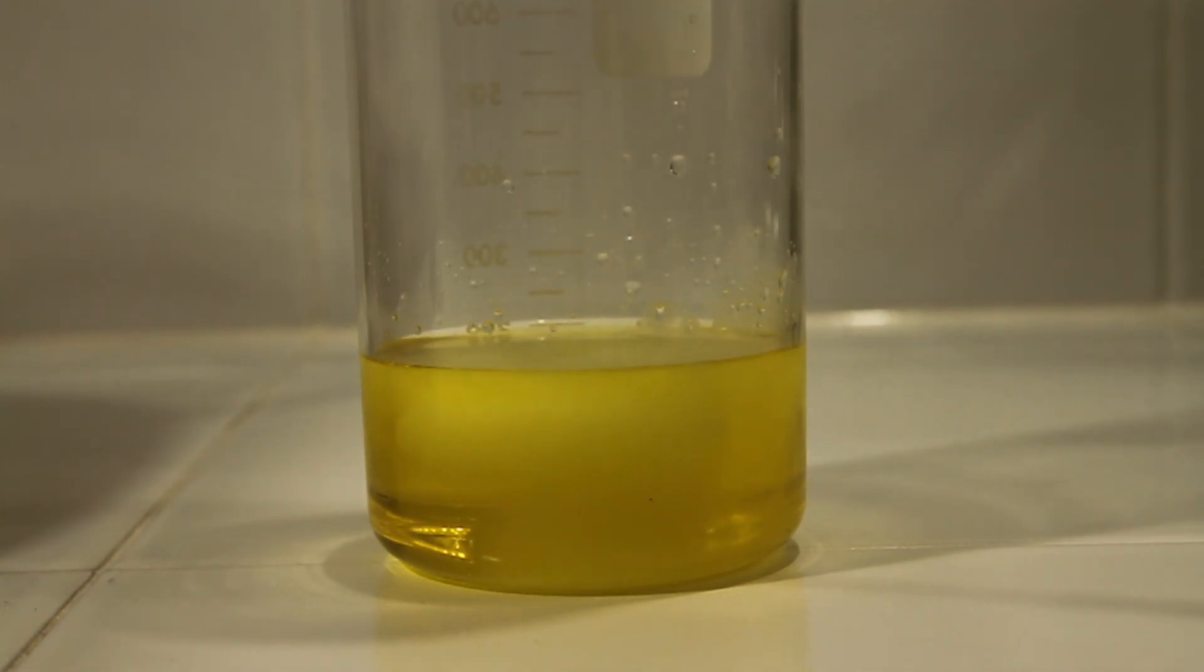This is added into the solution slowly, sprinkle by sprinkle, and you'll notice over time the solution will change color and it kind of darkens to a brown as the gold comes out of solution and precipitates out and settles to the bottom of the beaker.